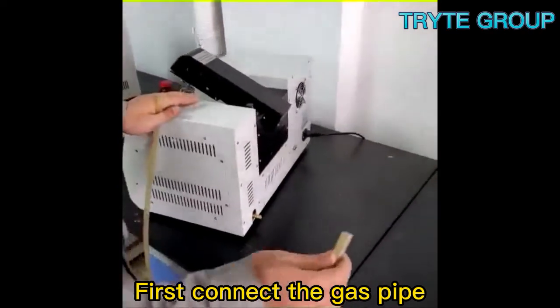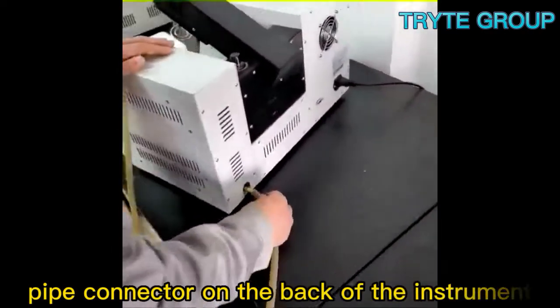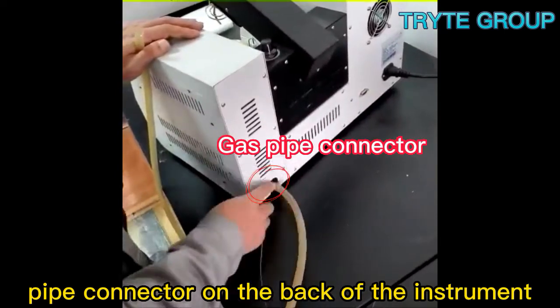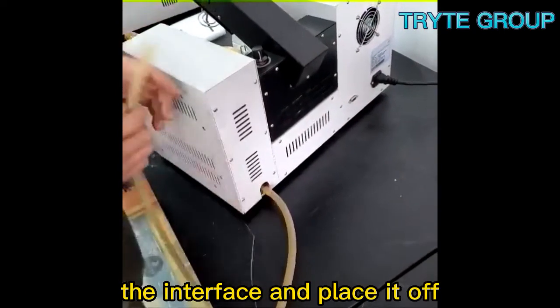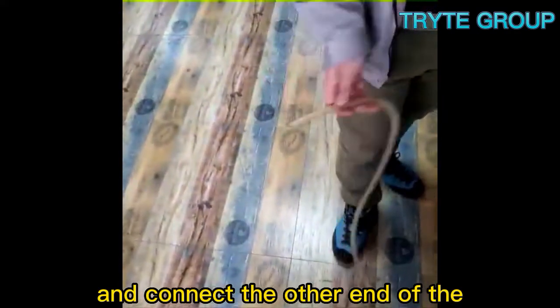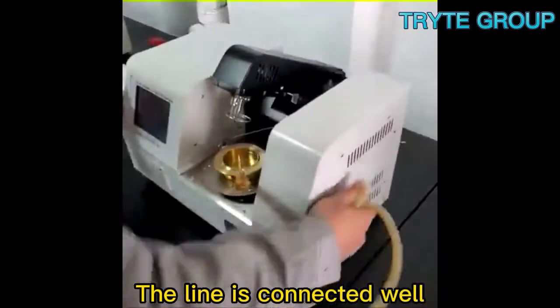First, connect the gas pipe. Connect one end of the gas pipe to the gas pipe connector on the back of the instrument. Use the clamping device to clamp the interface and place it off. Connect the other end of the gas pipe to the gas bottle. The line is connected well.